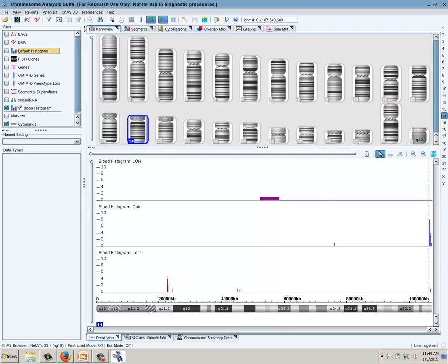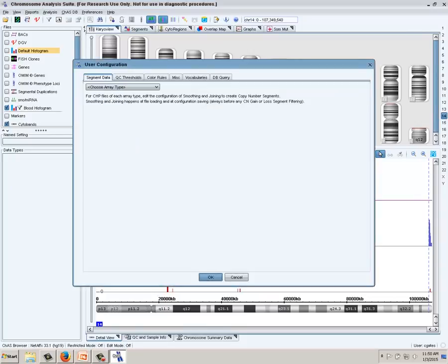All right, before we load the sample, we're going to go into just a little bit of what we talked about of where you can set your overlap and coverage count. We're going to click on this notepad or the edit configuration dialog box.